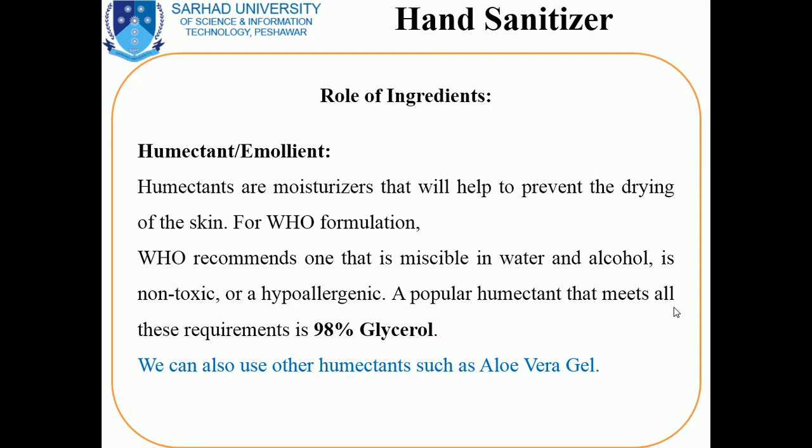For the formulation, the World Health Organization, WHO, recommends one that is miscible in water and alcohol, is non-toxic and hypoallergenic, that is not responsible for allergic reactions.